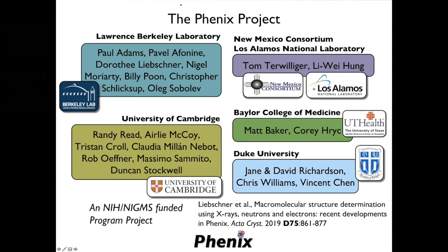For doing individual anisotropic B-factor refinement, you're thinking about a resolution range of 1.5, 1.7 angstrom. That's 1.7, 1.6 and higher. That's where you do individual anisotropic B-factor refinement. And to do TLS, it doesn't really matter. Conceptually, you can do it at any resolution.